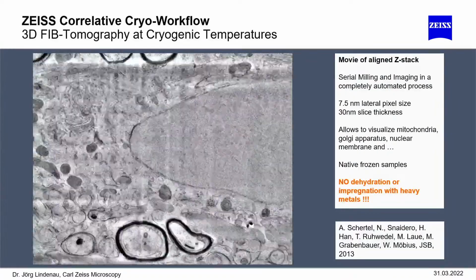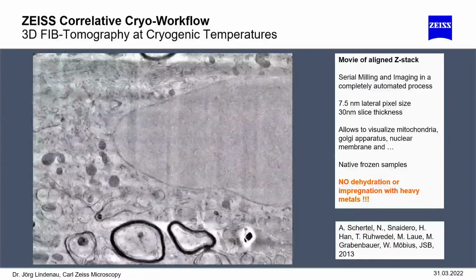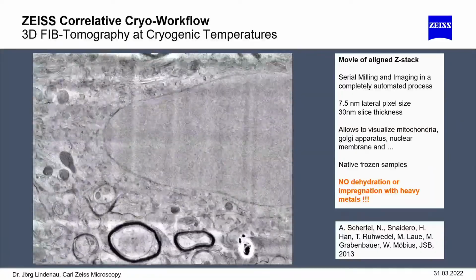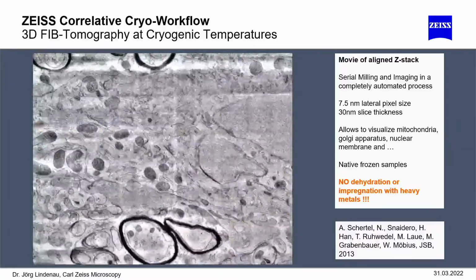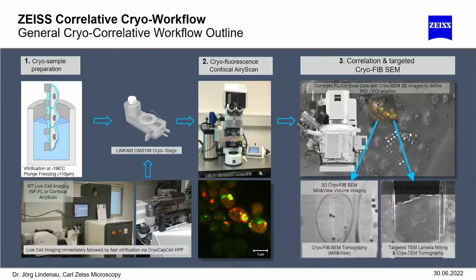This is one of the very first images acquired in the crossbeam, this is just the raw data, no destriping, no denoising, nothing. This is from quite some years ago already. And so we see contrast without any labeling, so we know this all. The workflow which we would like to concentrate on today: there are potentially two different methods of sample preparation. We have seen a lot of plunge freezing. I would like to focus a little bit on high pressure freezing here.